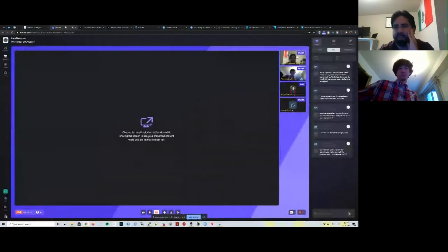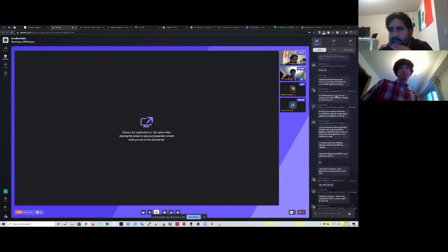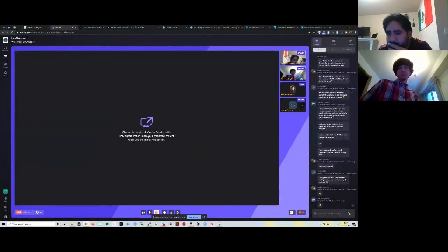Now, let me see if there are any questions in the meantime on the feed. There isn't anything in the Q&A, but in the feed, there's been kind of a lot of excitement about sample swaps. Yeah, sample swaps can be really hard to resolve, and so we've tried our best with Nick and Josh, and ultimately you can explain swaps multiple ways.